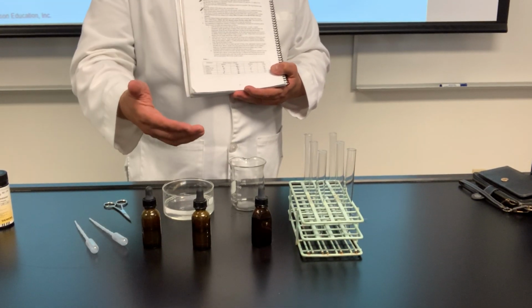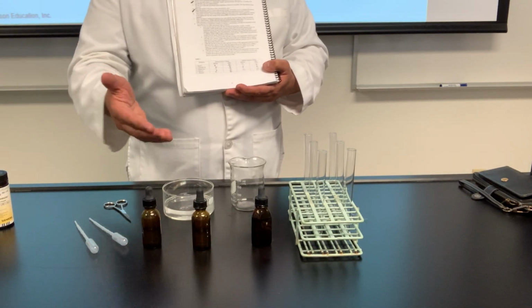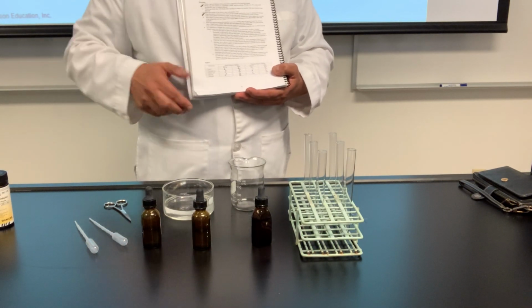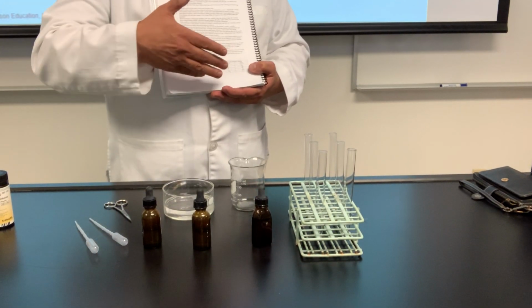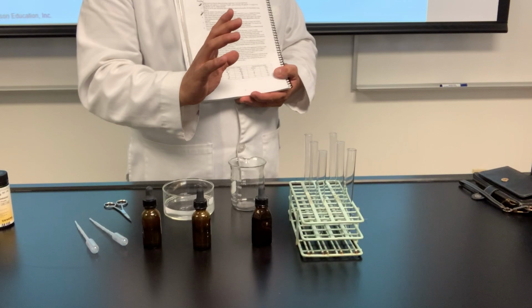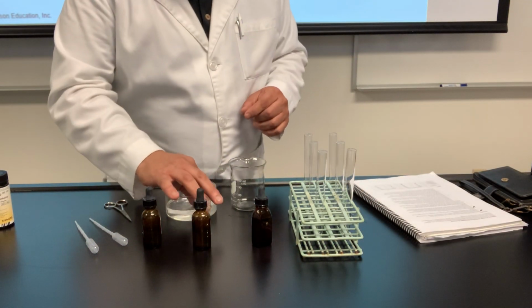Now, an hour later or so, what do we have? After an hour of dialysis now, what do we have? Well, we're going to do a test to confirm this. Everything that I just told you was a hypothesis. That's our prediction, right? But you know what? We have to confirm it.